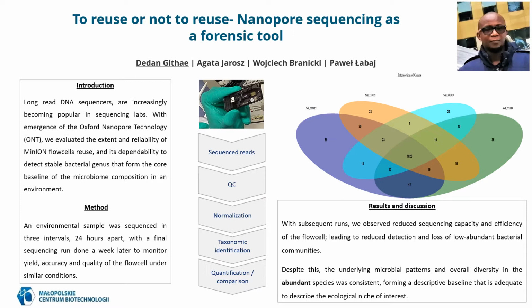I want to present to you a poster from one of our works titled To Reuse or Not to Reuse, Nanopore Sequencing as a Forensic Tool. The study of microbial communities, their diversity and abundance, has been used in the field of microbial forensics as a way of gaining insight and intelligence of their ecological niche.